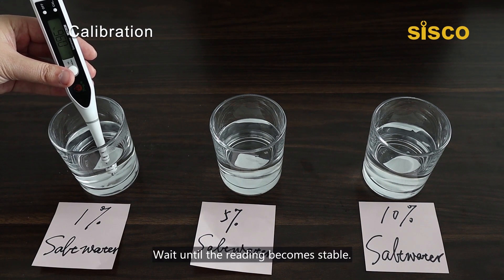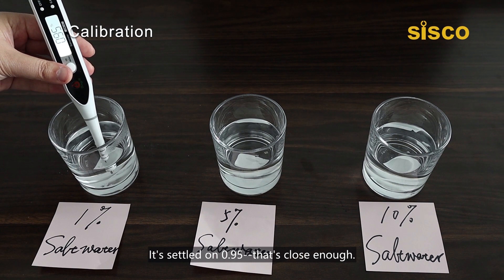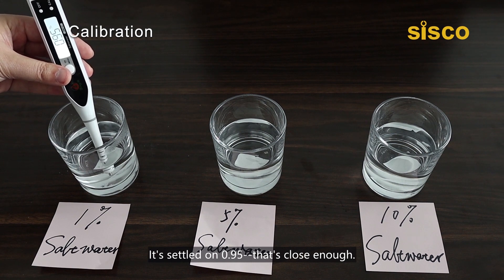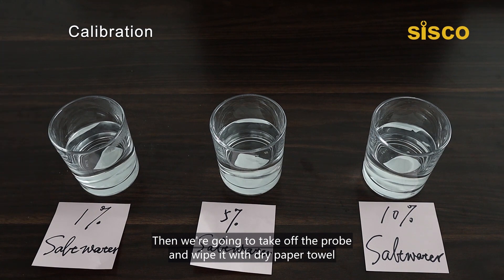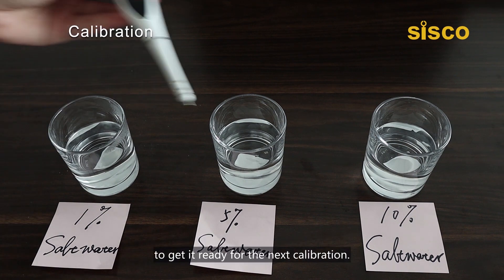Wait until the reading becomes stable. It's settled on 0.95, that's close enough. Then we're going to take off the probe and wipe it with dry paper towel to get ready for the next calibration.